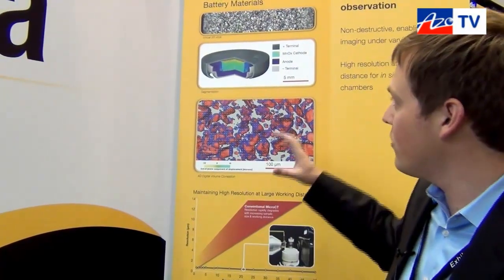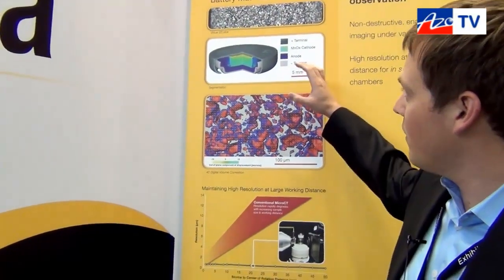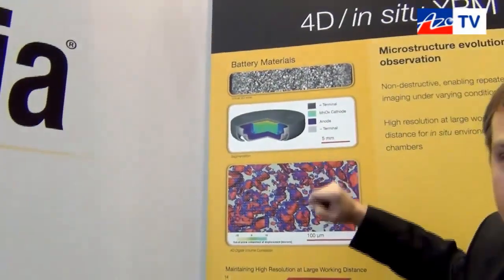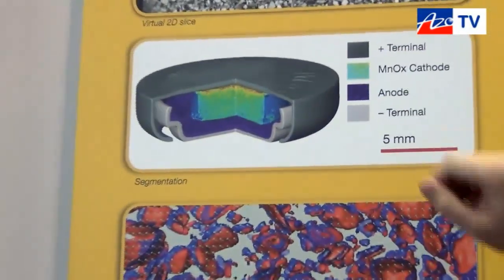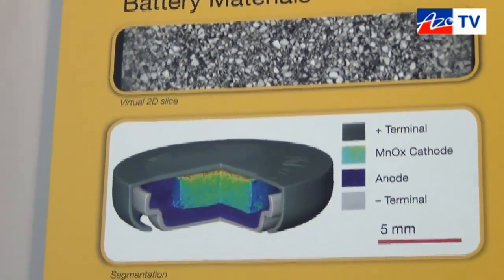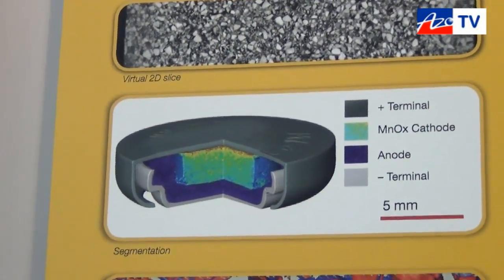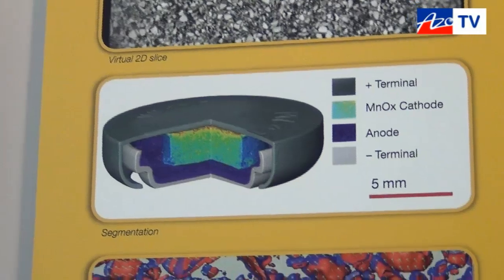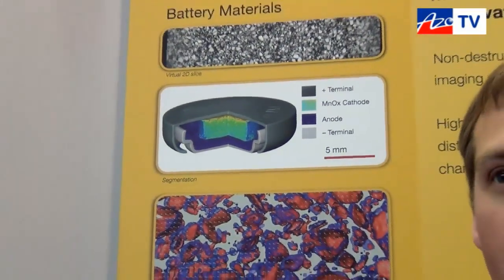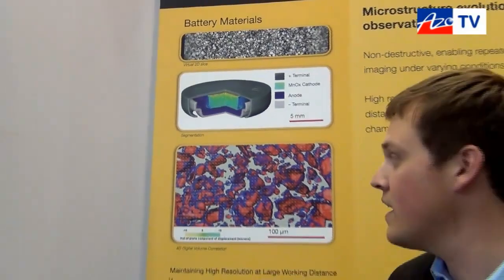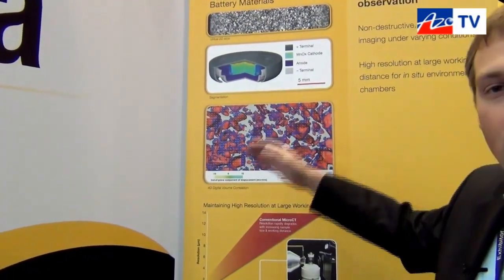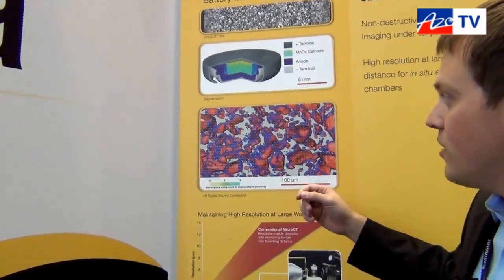Getting back to the result, what you see here is the ability to non-destructively image within this battery. This is a coin cell and we're looking at the anode and looking at a virtual cross-section of its microstructure that occurs on many different length scales. Now you can segment this, meaning you can separate each particle into its individual constituents, and then compare two different data sets before it's been charged and after it's been charged.